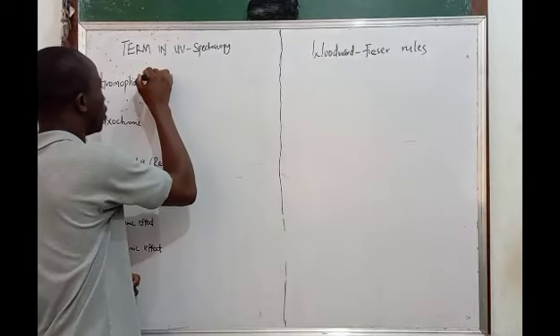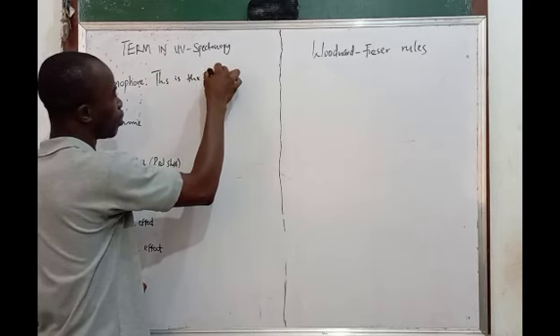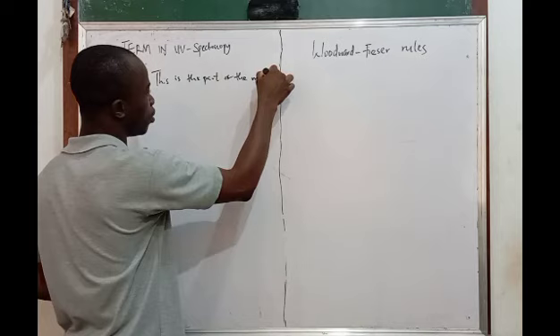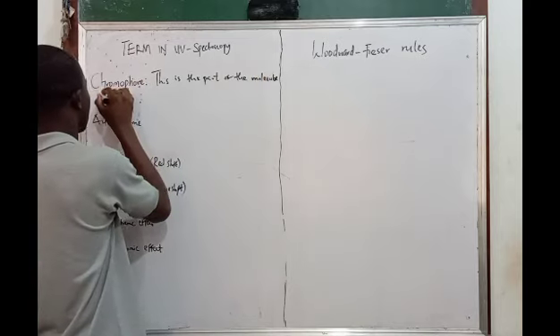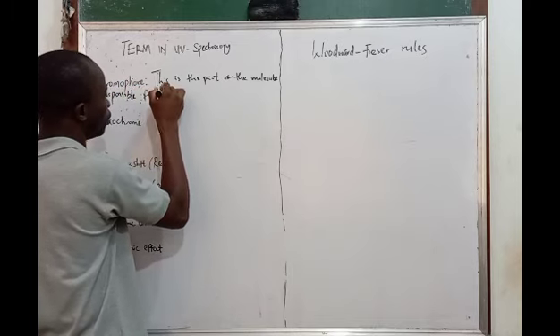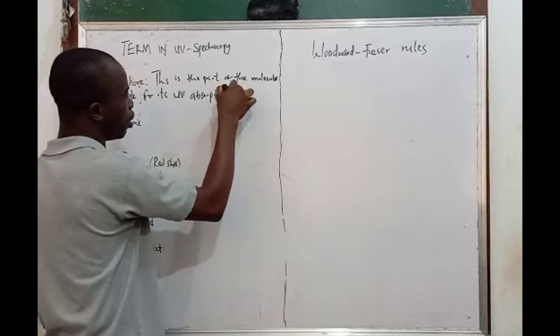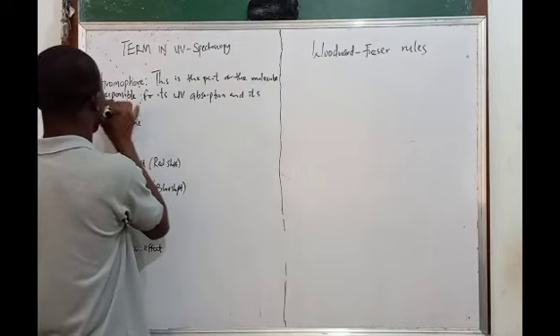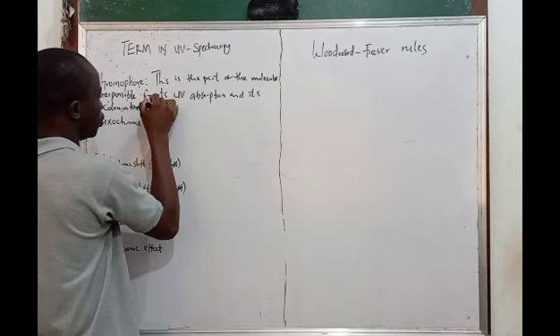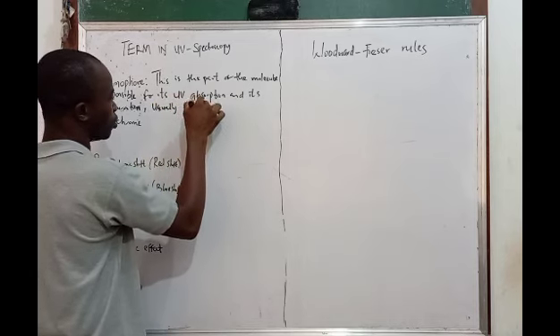So this is the part of the molecule responsible for its UV absorption and its coloration. Usually unsaturated.